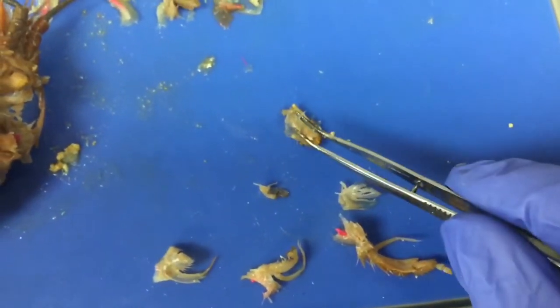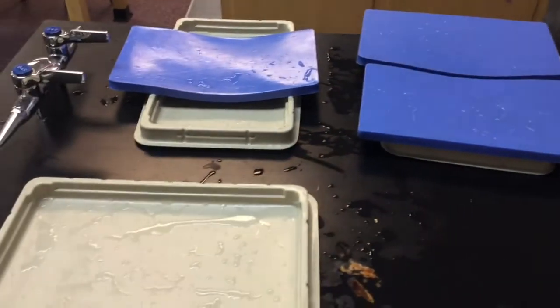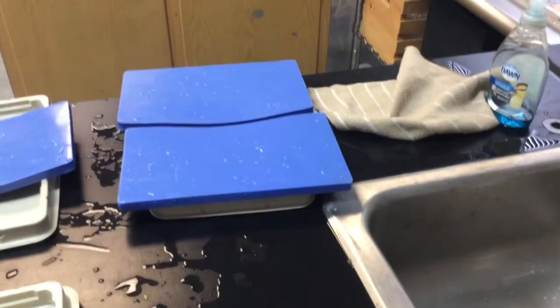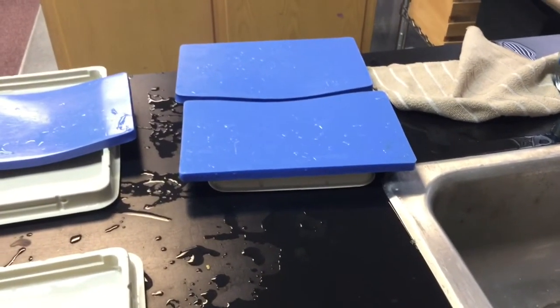And at the end of each dissection, you must clean up your area and throw away all of the parts.